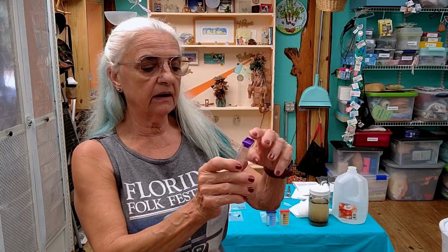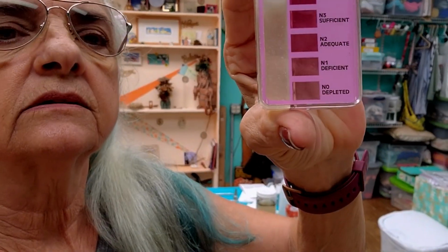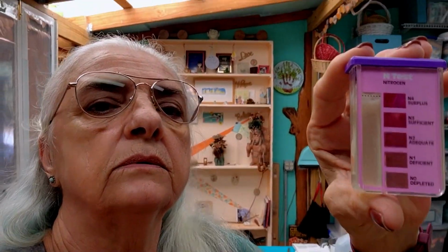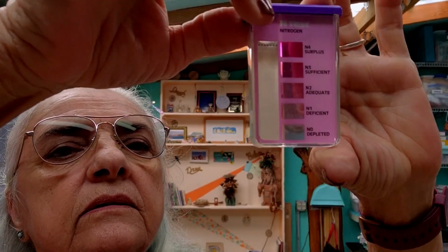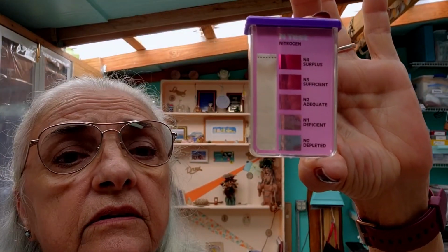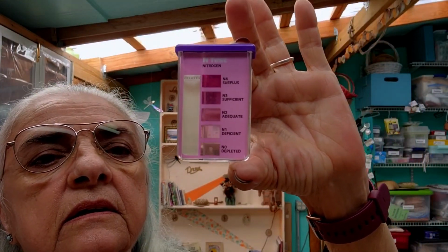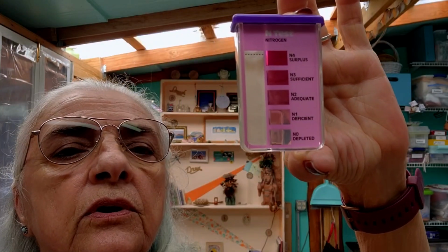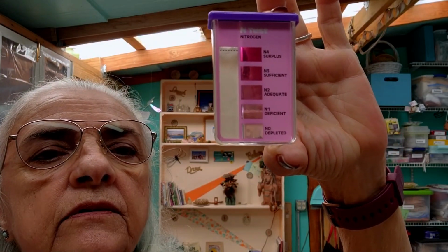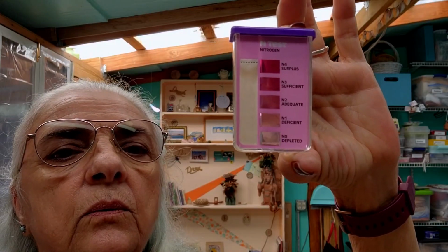I have to say that as I can see it, our solution, and let's see if I can make this go to, I have some skylights. See if we can tell. There's nothing. It is depleted. This one doesn't even have a purple hue that the nitrogen would have, and so we know there's no nitrogen in this soil.